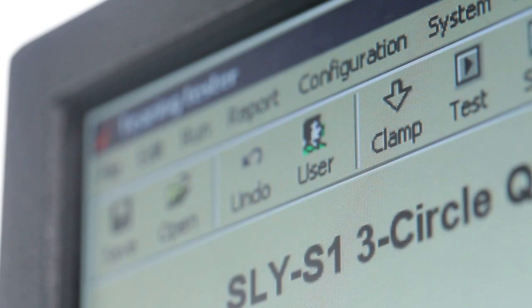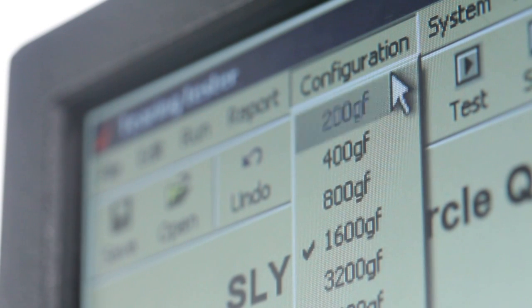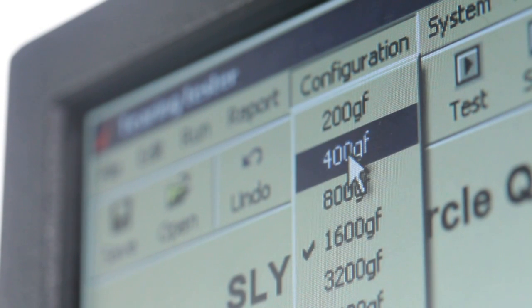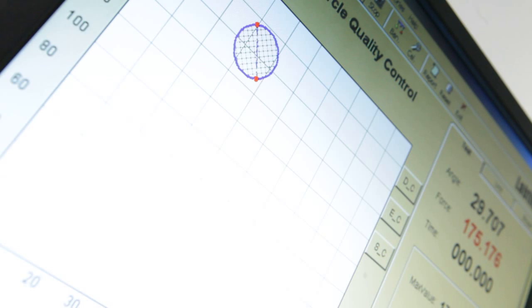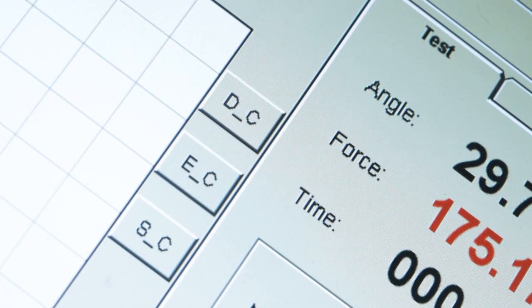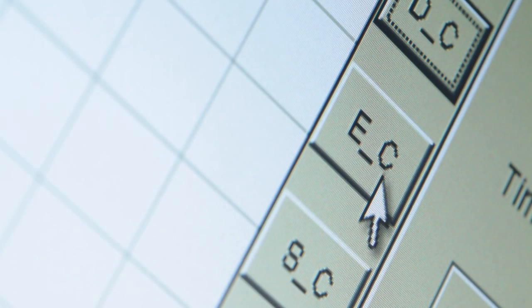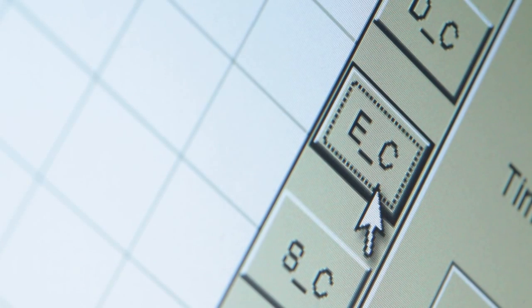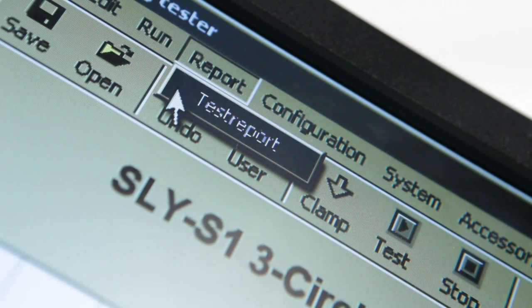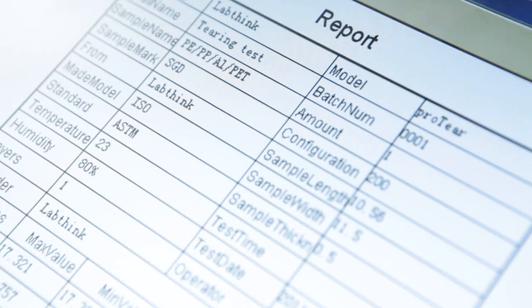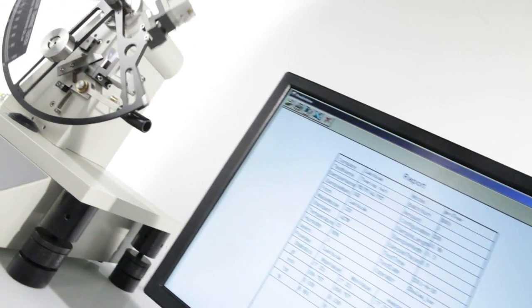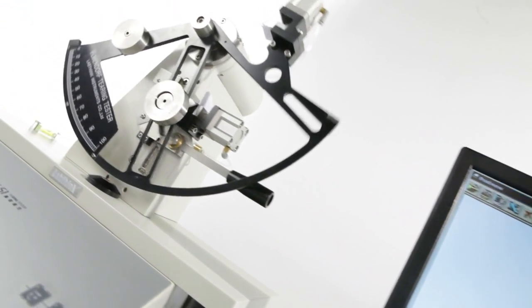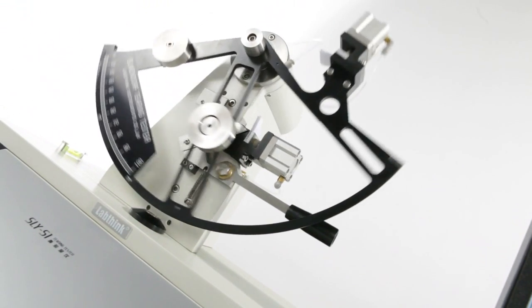The three-circle quality control function provides three analytical models, including discrete-circle, error-circle, and standard-circle, which can help users easily understand the correlation between the test data and thus properly analyze and evaluate the quality of the specimen.